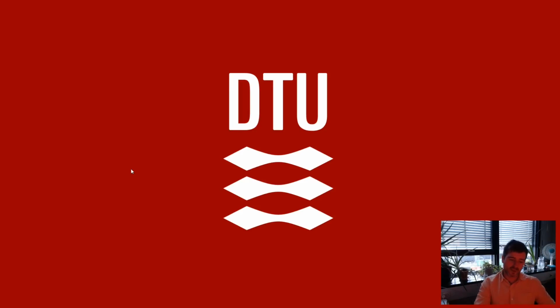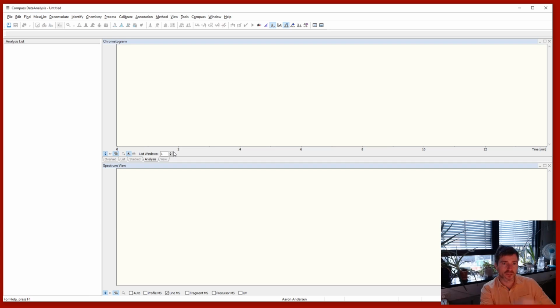Today we're going to be looking at data analysis in the Bruker software called DataAnalysis. So this is for inspecting your LCMS data. Once you have it all installed, you should be greeted with a screen that looks something like this.